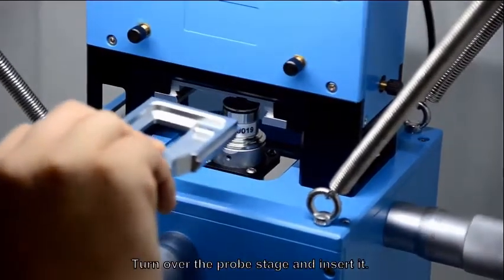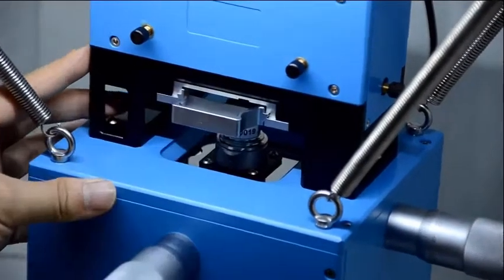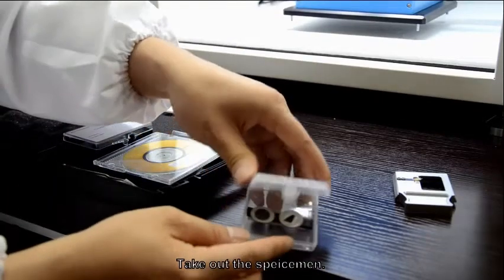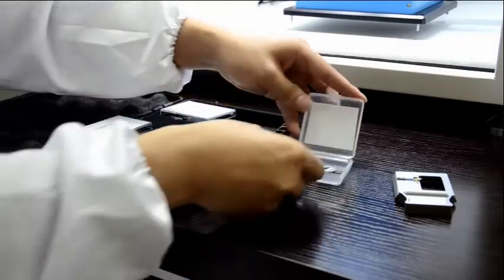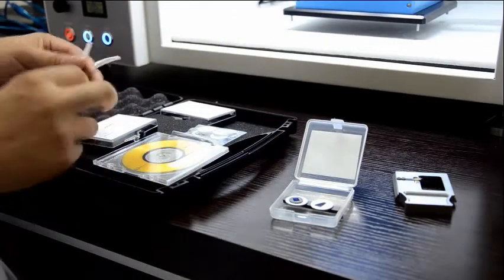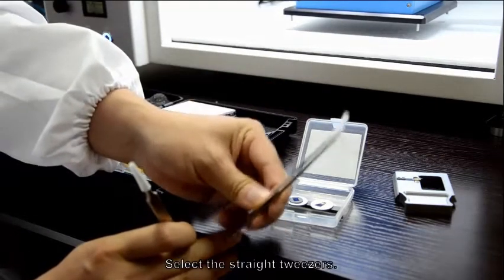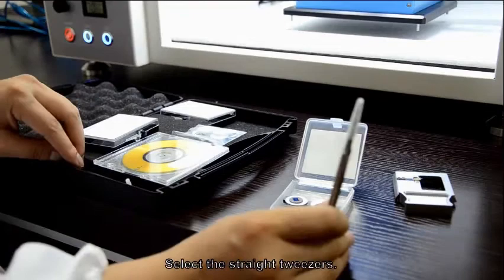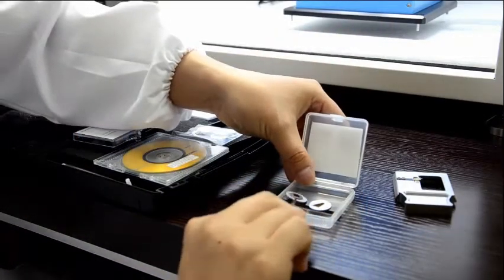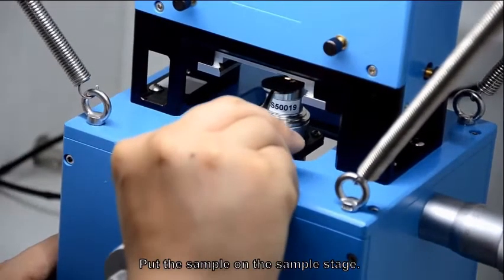Turn over the probe stage and insert it. Take out the specimen. Select the straight tweezers.